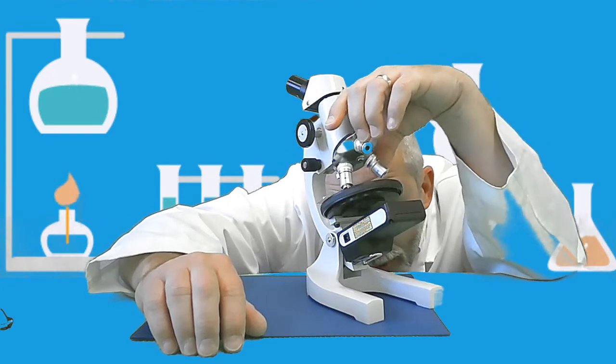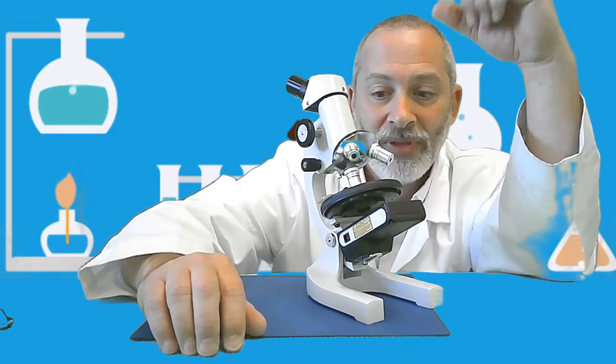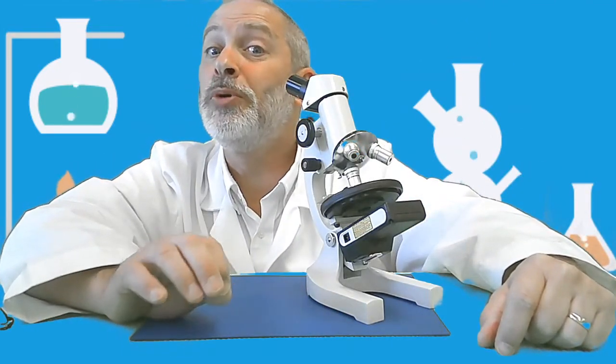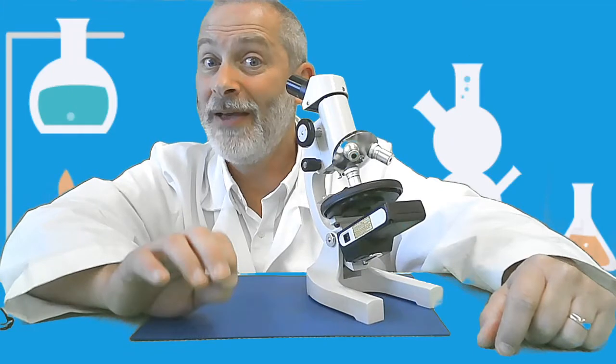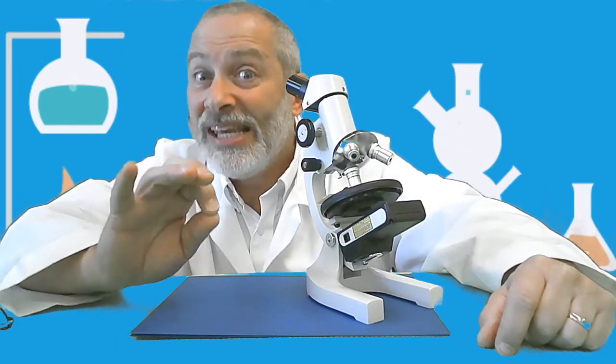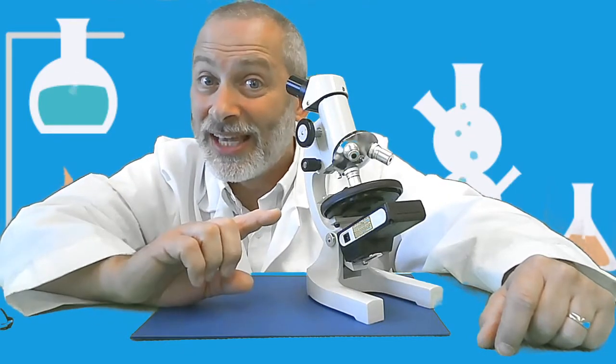And when you do, wow, that high power objective lens is super duper close to the slide. It's just a hair off the slide. It needs to be that close in order for you to see it.